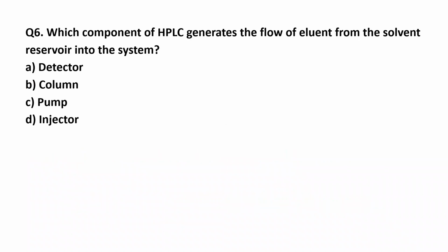Which component of HPLC generates the flow of eluent from the solvent reservoir into the system?